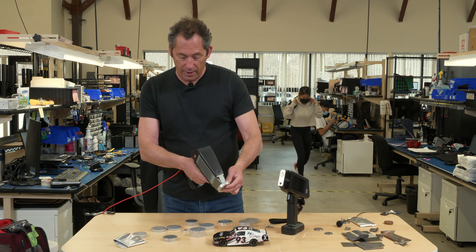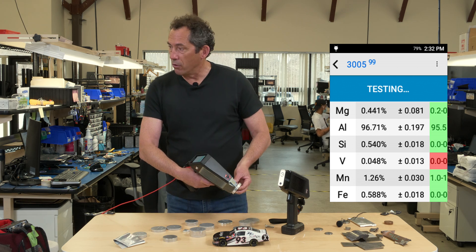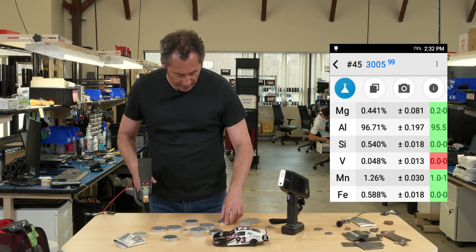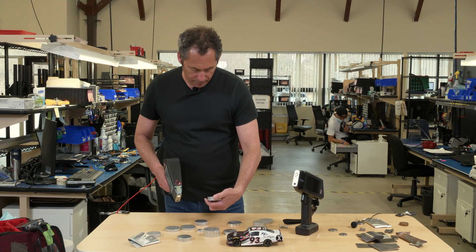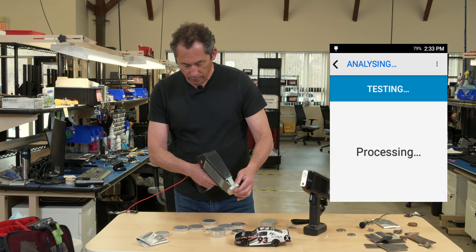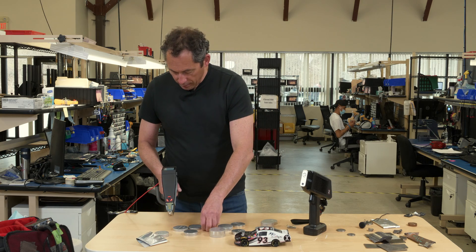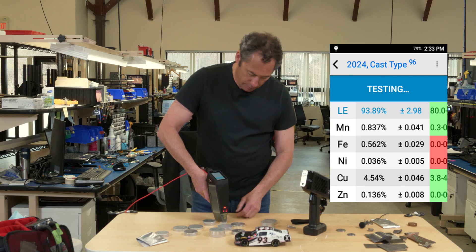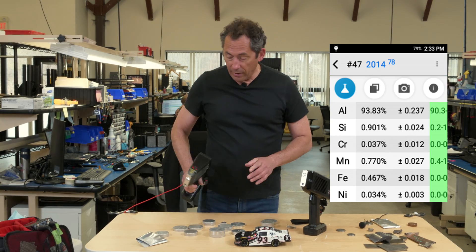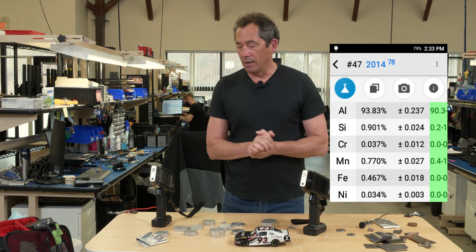Another great example: remember that 3005 that we called 3003? Same story — when it flips over to that second beam and gives it a few more seconds, there's your low magnesium, so it knows it's a 3005. Without doing that second beam, it'll call it a 3003. And for 2024: when it makes the magnesium measurement, it really nails it as 2024. Unlike 2014 — if you shoot that one and it flips over, it doesn't see any magnesium, so it knows it's 2014, not 2024. That second beam takes a few more seconds, but if you need to really sort out a wide variety of aluminum alloys quickly, that's the way to do it.